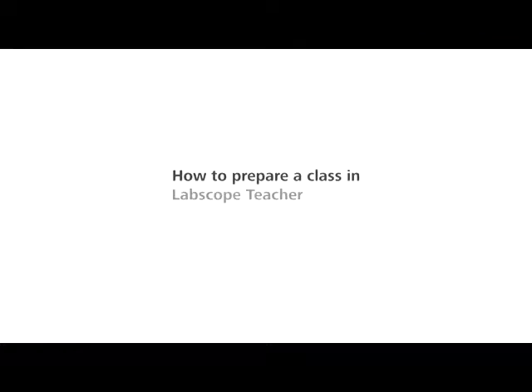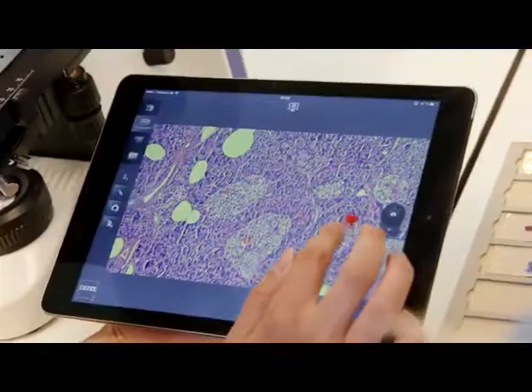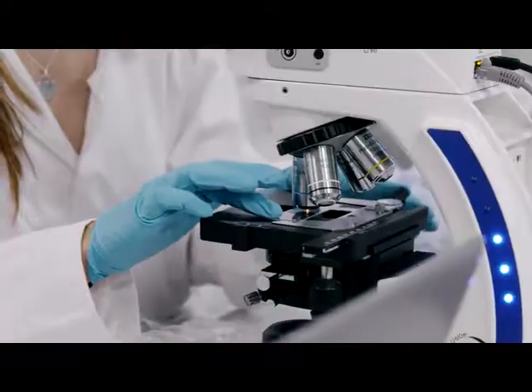How to prepare a class in Labscope Teacher. As a teacher, you give lectures in different classes. One day, you explain the mitosis of cells with 2 groups of students.